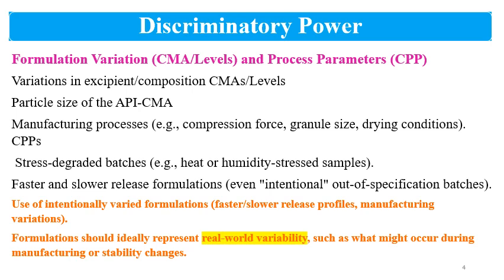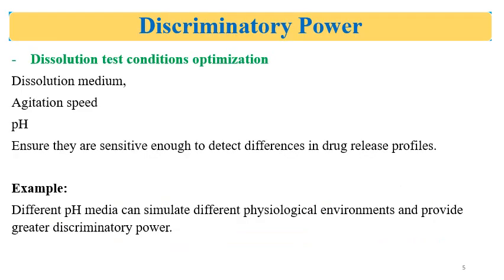Then optimize the dissolution test conditions like agitation speed and pH, so that you can ensure that these are enough to detect the differences in the release profiles.